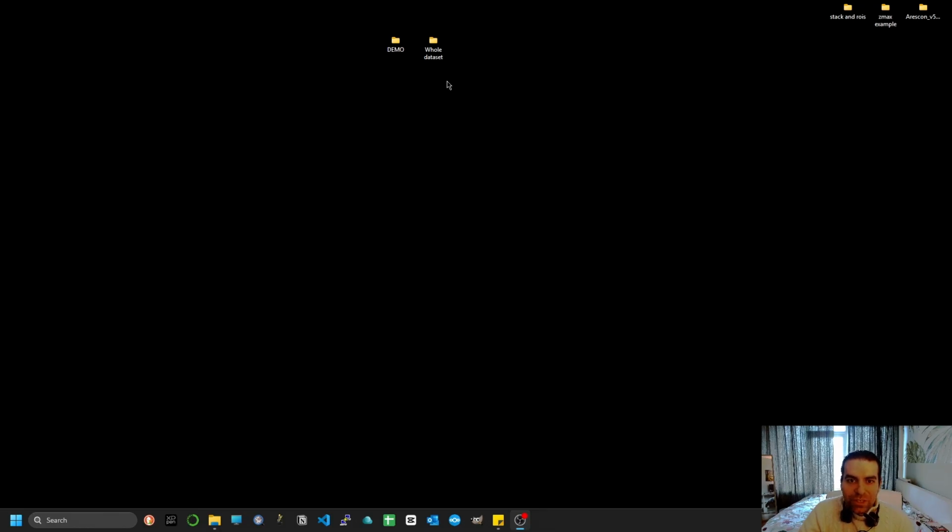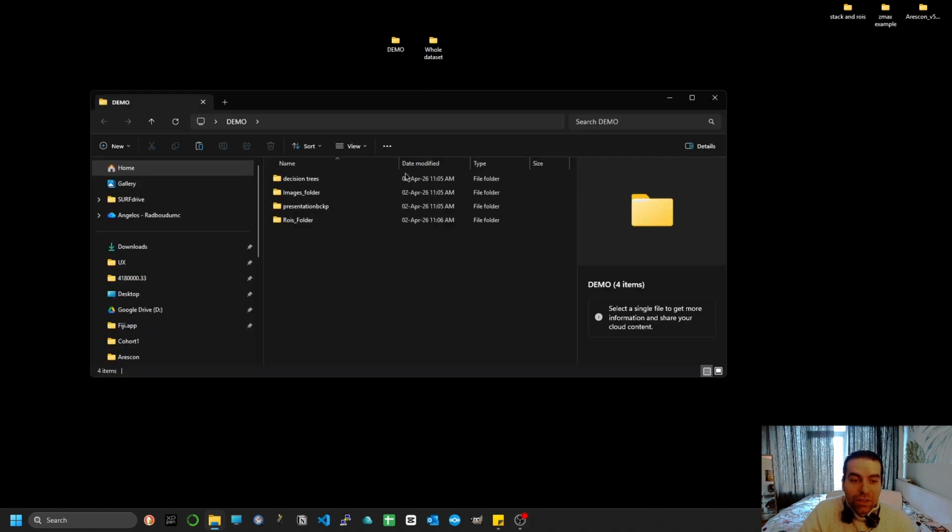So in the previous video I've been using a small but whole, in a sense, dataset. In this one I will just be using a demo version. The difference between the demo and the whole dataset is that in the demo we'll just have one plane. Now normally you can use Arescon for one plane, but usually it becomes more robust if you use more planes, and I will explain why again, of course.